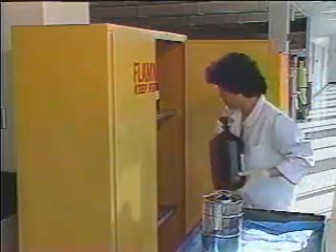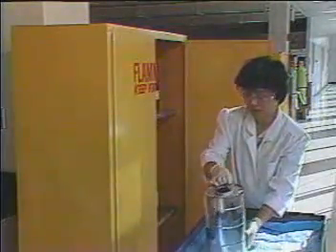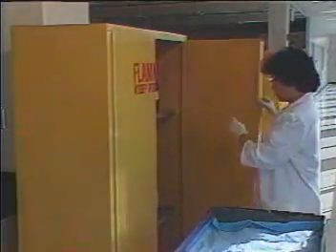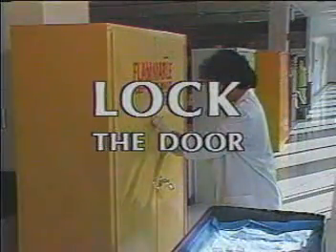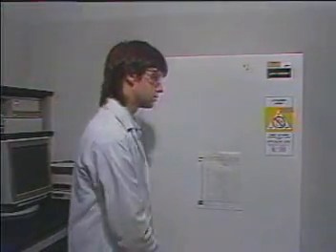We should store amounts greater than 1 liter in approved flammables cabinets. Cabinets need not be vented, but if they are, the vent pipe should have a flame arrestor. Keep the door closed and locked. Do not store flammables in a lab refrigerator unless the unit is approved as explosion-proof.